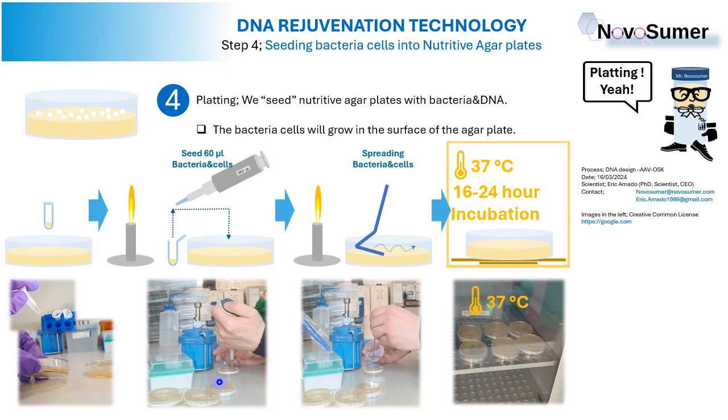And what do we do next? This step again is under sterile conditions with the flame. For this purpose, we use this tool here. It is just a piece of sterile plastic that helps us to spread the 60 microliters of cells.